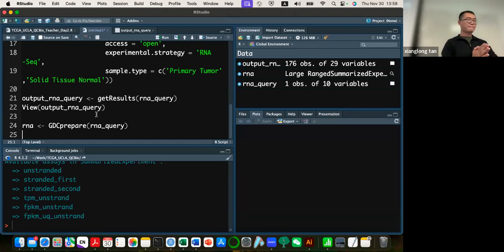The query is when we built the setups, we built the different filters, such as filtering only on transcriptomes, we filter this, we filter that. It's like the exploration page on the website. However, the prepare is a little bit like a repository page where actual files are being loaded. Yeah, that makes sense.